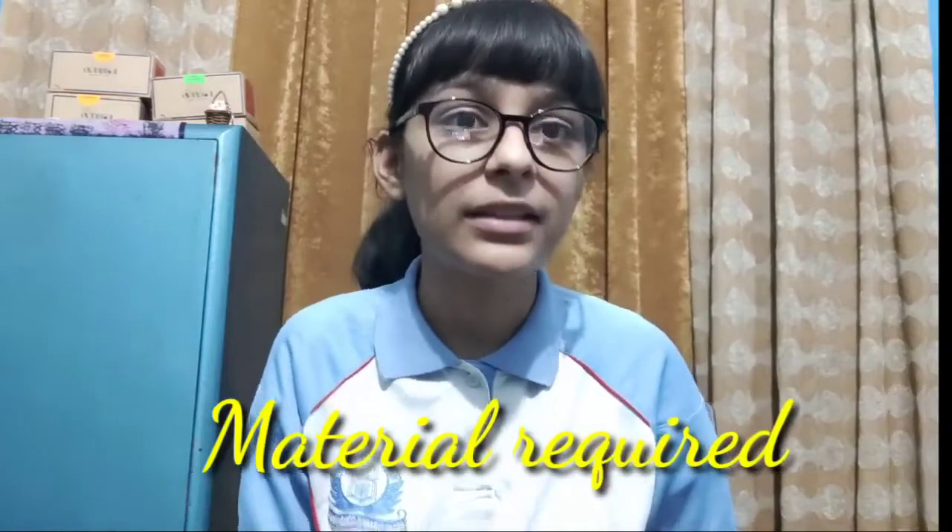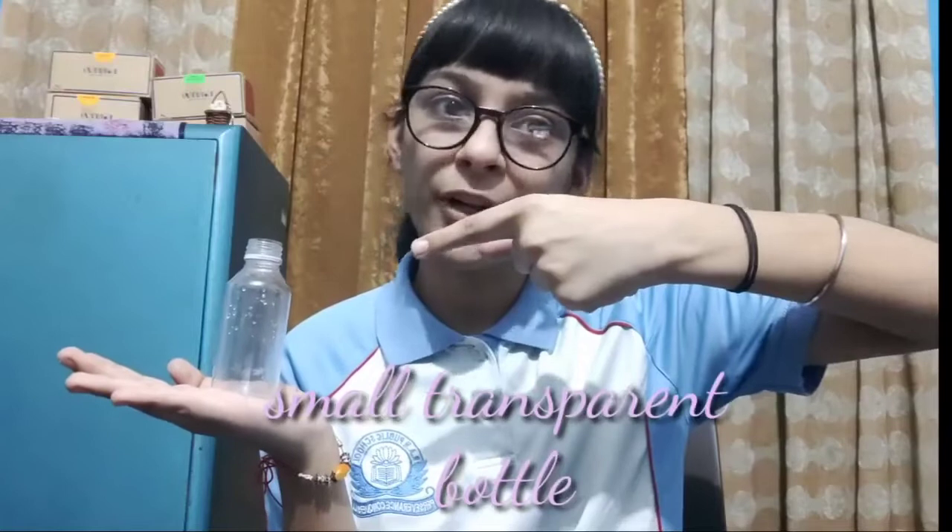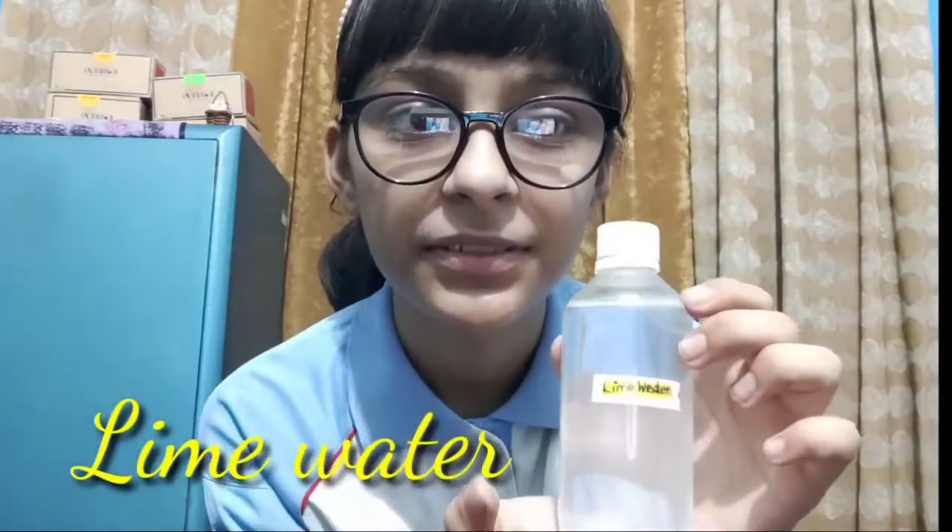Our first experiment is respiration in animals. The material required for this experiment is: number one, a small plastic bottle; number two, lime water; number three, two pipes or straws bent at 90 degrees; and the fourth material required is Homo sapiens, or a human being.